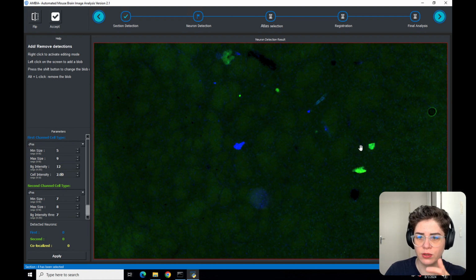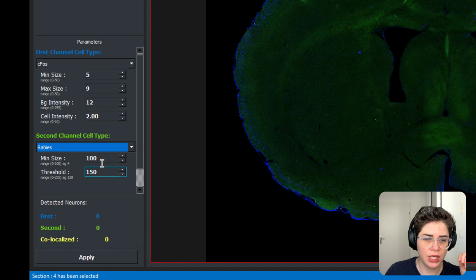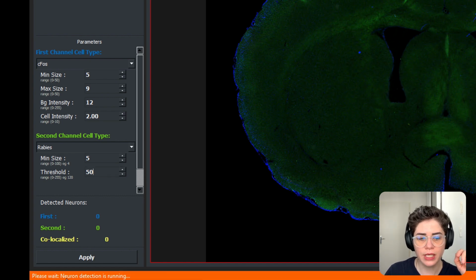And for the green channel, since we don't have anything, just imagine these are rabies, although they're not. Just imagine these are rabies. So let's pick rabies for channel 2. And for minimum size, I put 5 again. And for threshold, I put 50. And then I click apply. So down here, it says, wait, neuron detection is running.